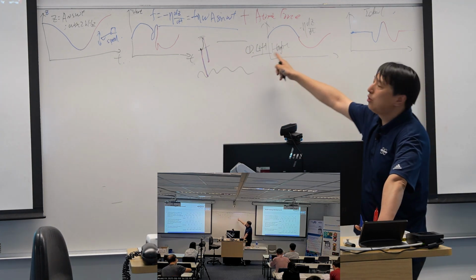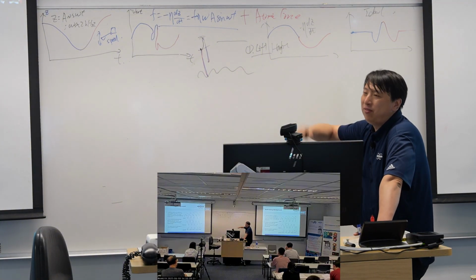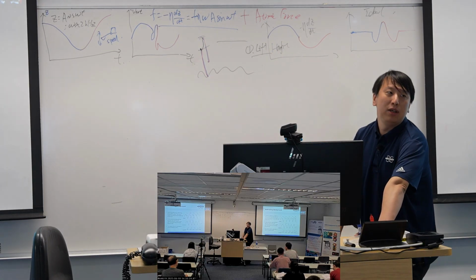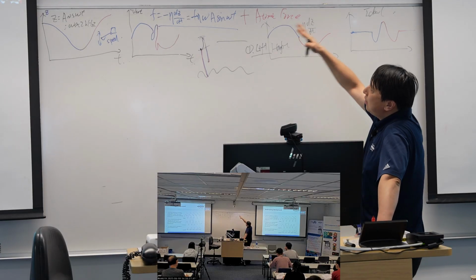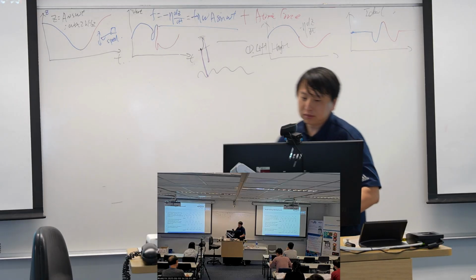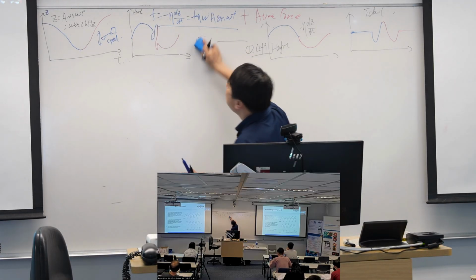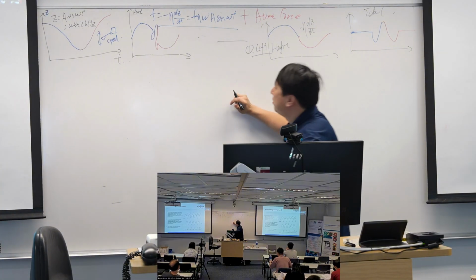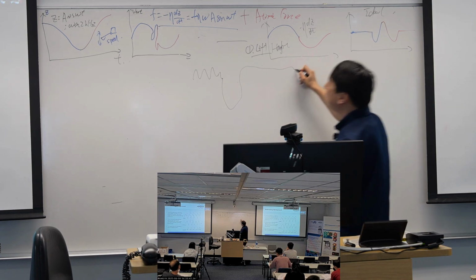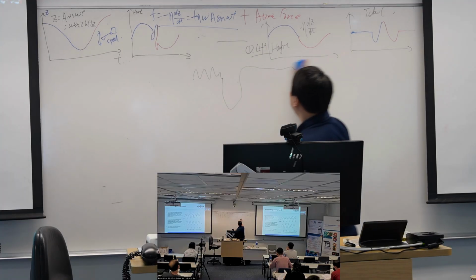Of course, this one should be as small as best, because if it's too large, the background may not be accurate. But this idea may not always work well, because we know our surface can change variously. For example, if we have some samples like this, I draw it here.